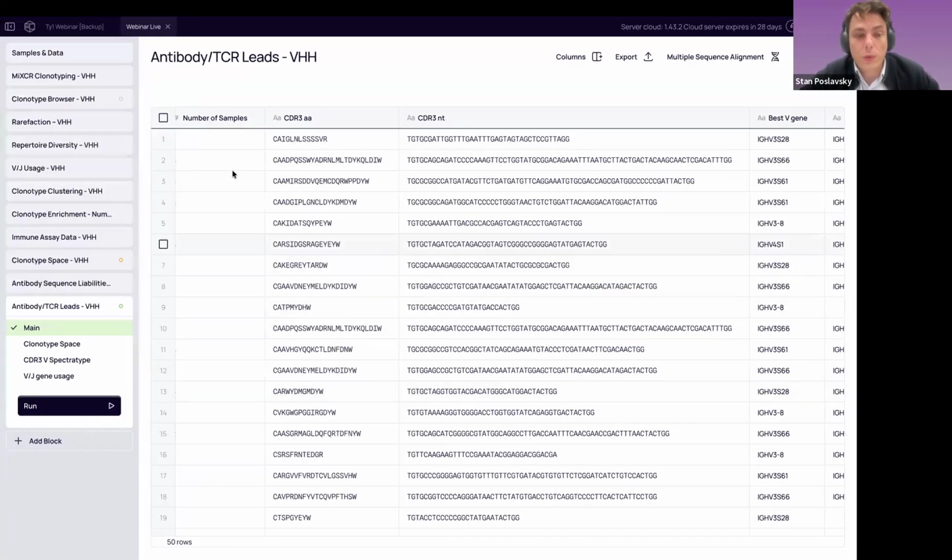The languages that we use, obviously, we provide this SDK to make it as easy as possible for bioinformatic developers. All the blocks that we have are developed by our bioinformatic developers. The language for the user interface is TypeScript, nothing else can be done. For the workflow, we have the standard workflow language. Yeah, and that's it. There is a certain level of entrance, but once you get it, you can build so many applications and expand the audience of users.